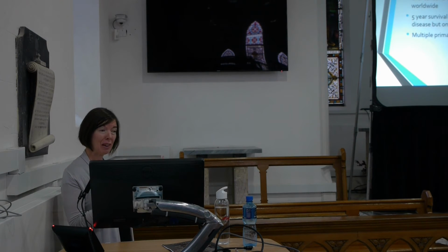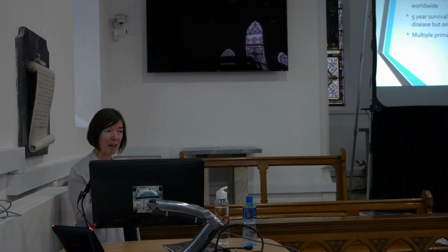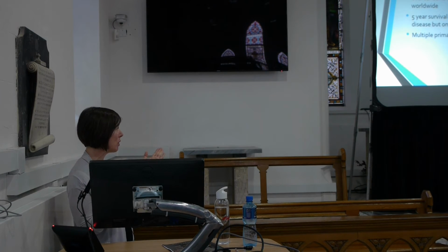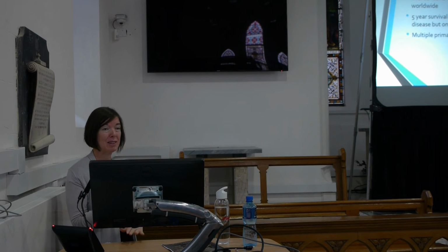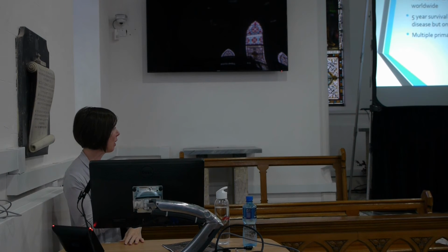So again, like with cervical cancer, there's a need here for an objective technique. What's done at the moment is they take a biopsy and do the histopathology. But again, as I said, this has limitations. So we feel that Raman spectroscopy could have a role here.